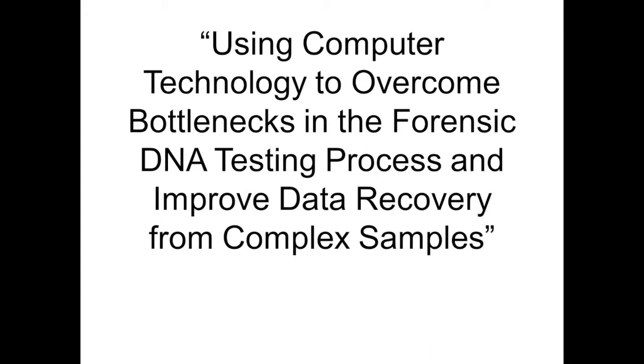Beaufort's in South Carolina. So what I want to talk about today is how we use the DNA testing process, or how we use TrueAllele basically to overcome bottlenecks in our process and improve data recovery. And that's a long wordy title, but basically all we're doing is using the computer to help us figure out where to go.